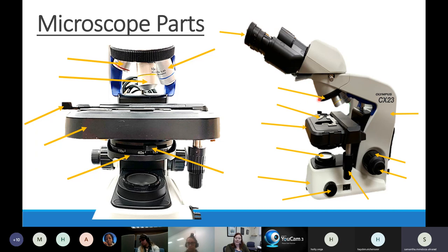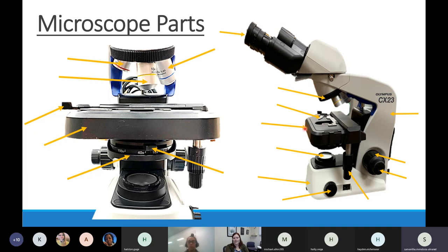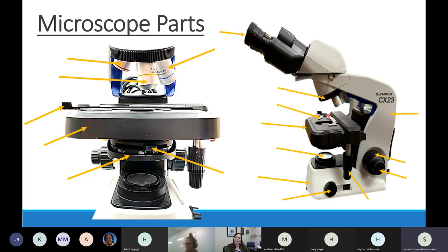What we look at when using a microscope is a little glass slide. We put our slide on this big black part called the mechanical stage. The mechanical stage holds your slides and has the ability to move up and down. On the mechanical stage, notice this silver metal thing - it's called the stage clip. The stage clip holds your microscope slide in place while it moves or when you need to move the slide left and right.